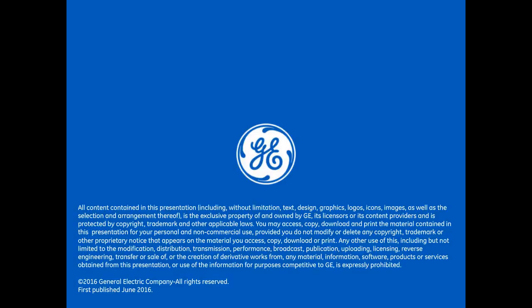And it looks like our first question in the queue is, when you optimized with Cas9 plasmid, why didn't you wait 24 hours before transfecting the guide RNA instead of co-transfecting? Wouldn't it give you better results? Okay, so it sounds like you're referring to the method of letting the Cas9 plasmid get a head start on being transcribed and translated into the protein before adding the CRISPR and tracer RNA.